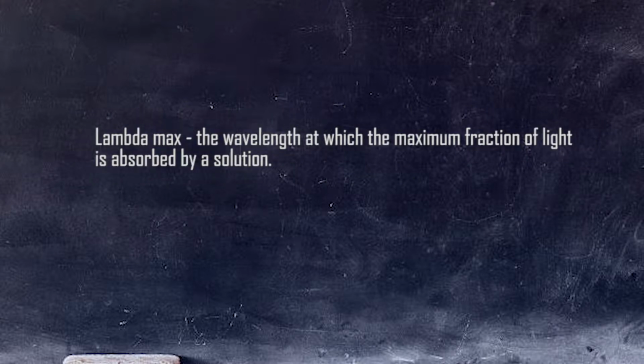Another reason why you scan across all wavelengths is to determine the lambda max, or the wavelength at which the maximum fraction of light is absorbed by a solution. For this lab, our lambda max was the best wavelength for determining the relationship between absorbance and concentration.